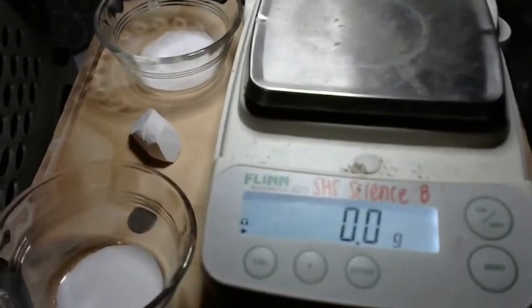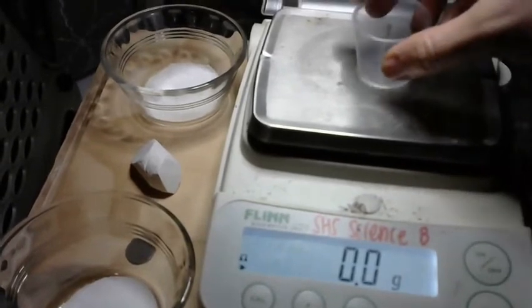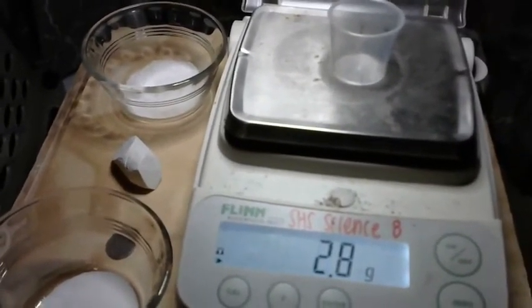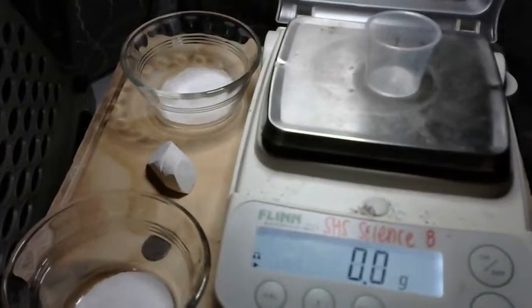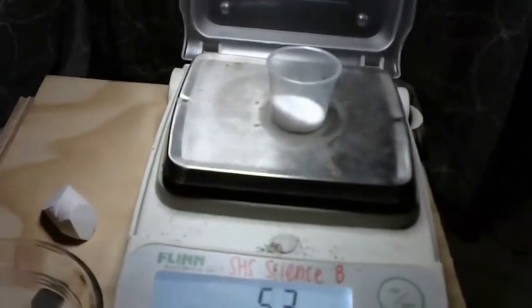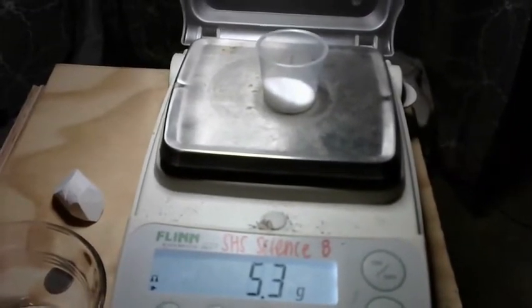Okay. The next thing that we're going to do is find the mass of salt. The reason we're going to find the mass of salt is because I would like for you to find the number of atoms present in salt, or in this case, how many ions are present. So I'm going to zero this scale, and then I'm going to grab my salt sample and pour my salt in. And when I pour my salt in, I get 5.3 grams.